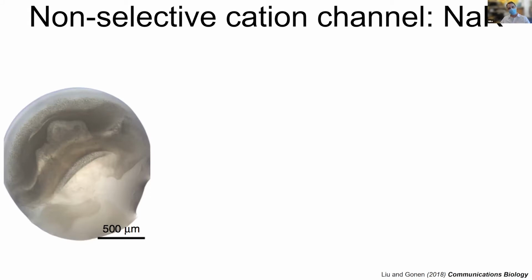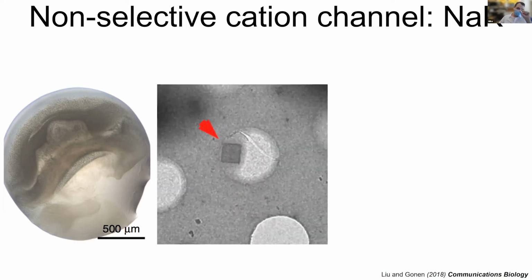They just melt. So after a long time, Xian was actually able to make sparse screens where he could make drops that looked like this, with tiny granular-looking crystals that fluoresced in UV. After putting them on the grid and screening around, he was able to find these tiny little cubes.